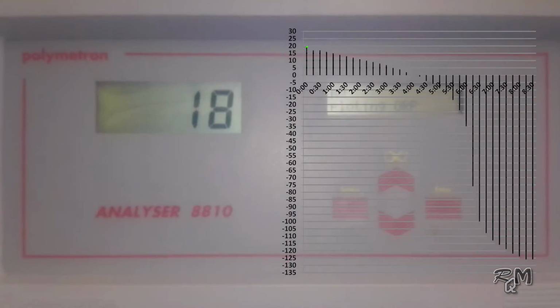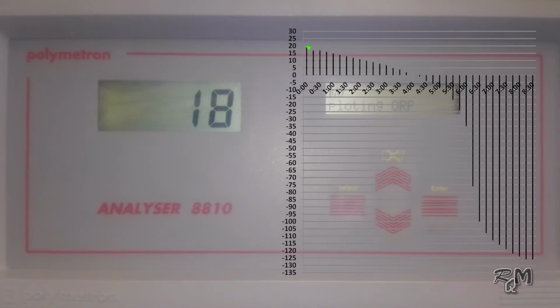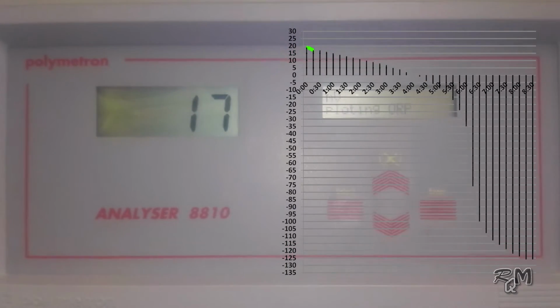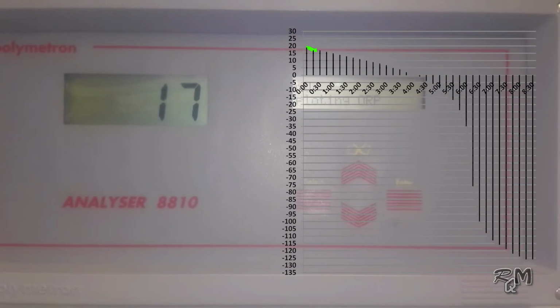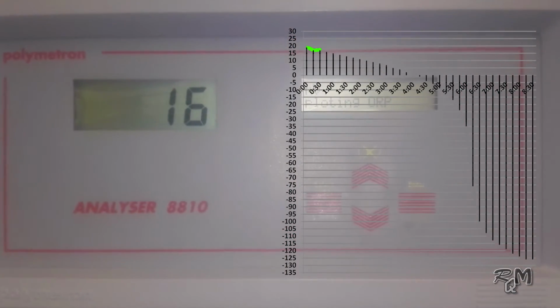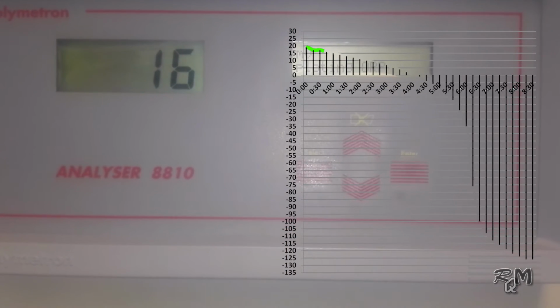In the beginning, from 2 to 4 minutes, the millivolt rate of change will be dead slow. You can see it is decreasing slowly. To observe this trend, you need patience. So with patience, observe this trend because it is the backbone of analyzer operation. I will give you surety: if you understand the purpose of plot ORP sequence, you can handle 80% of faults of these analyzers.